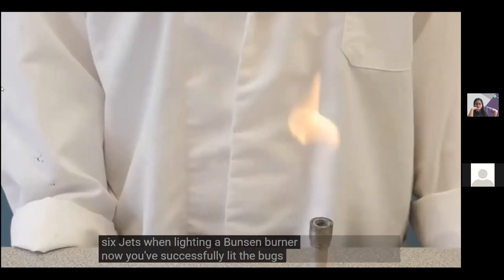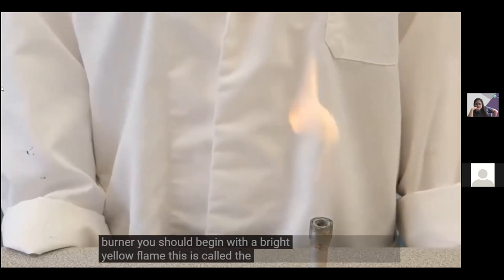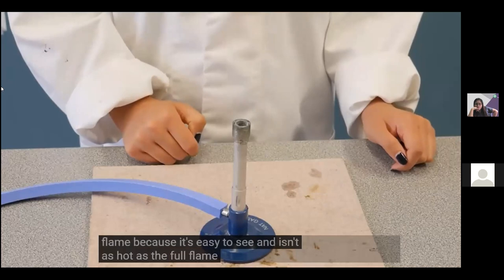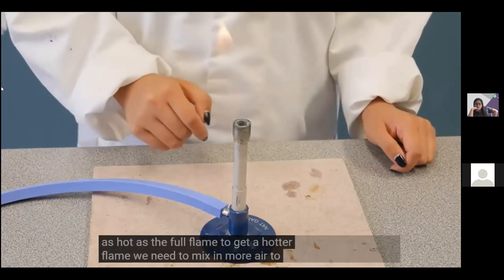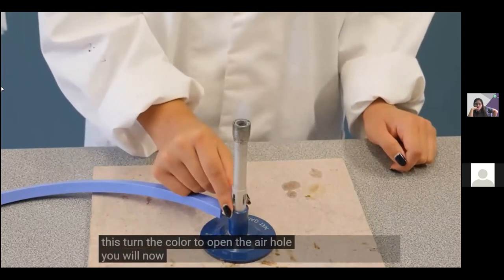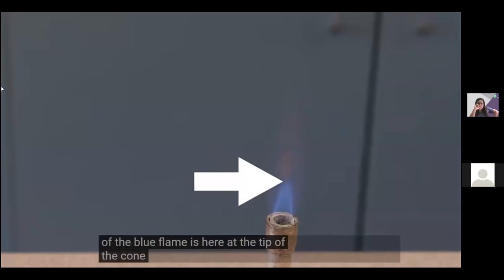Now you've successfully lit the Bunsen burner, you should begin with a bright yellow flame. This is called the safety flame because it's easy to see and isn't as hot as the full flame. To get a hotter flame, mix in more air by turning the collar to open the air hole. You will now have a blue flame with a bright blue inner core. The hottest part of the blue flame is at the tip of the inner cone.